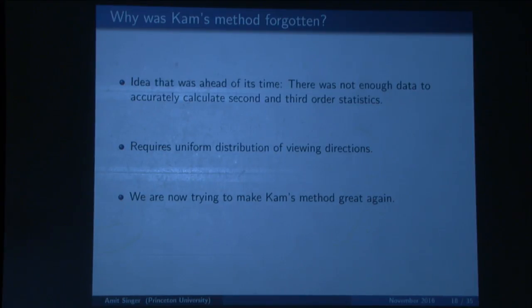Why? The molecule has some preferential direction. Usually they prefer, for example, to attach to the carbon film or the substrate with some preference. It's like if you throw a cat on the floor, right? It usually falls in one direction, not in any direction.